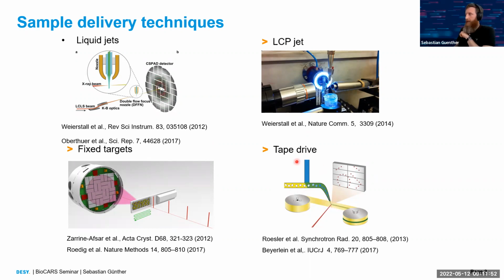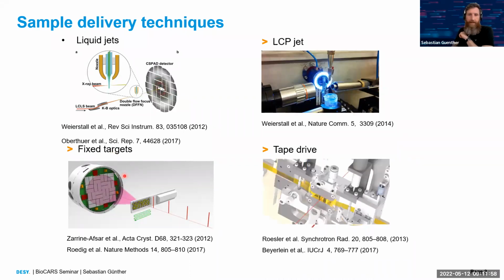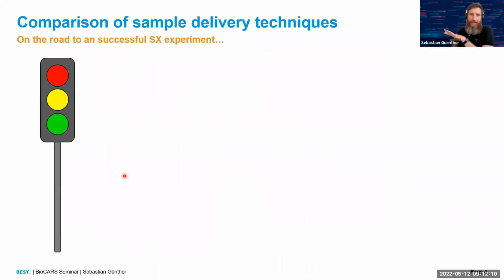And we have focused our developments on fixed targets because these are usually the easiest to handle, have very low sample consumption, and have rather low maintenance. So this is, I have to say, a biased view if you compare all the different sample delivery techniques.